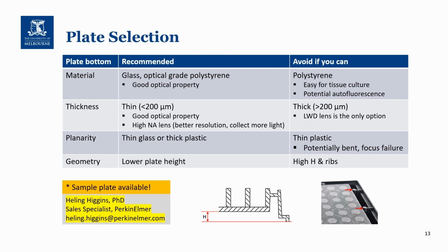Next we have planarity. You should always try to have a plate bottom that has thin glass or thick plastic, as these are more likely to have a flat surface. What you don't want to have is thin plastic, which can potentially be bent and cause a focus failure.